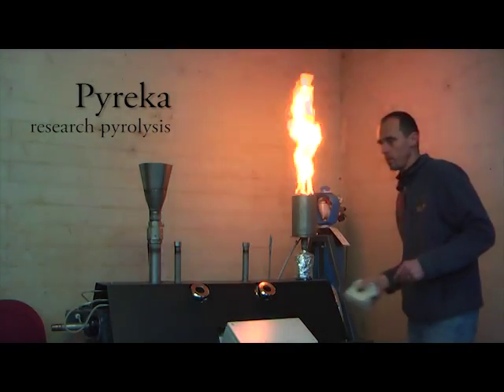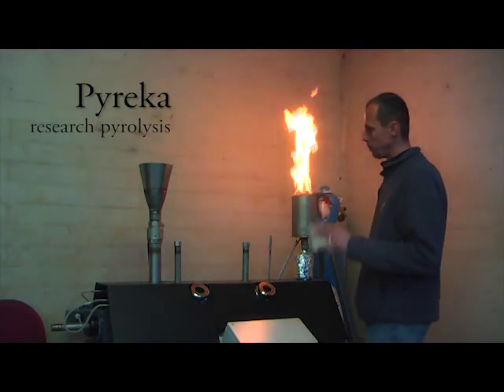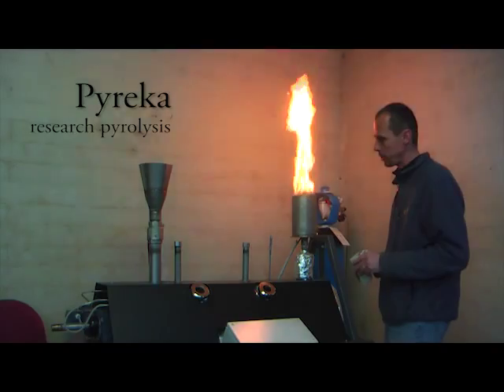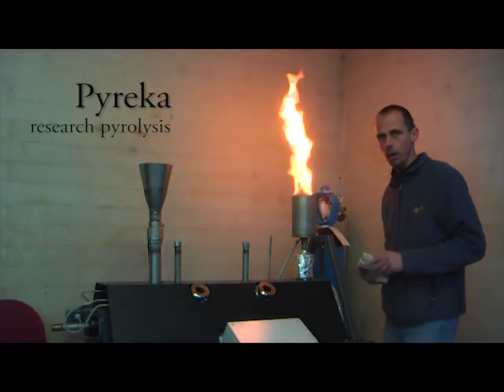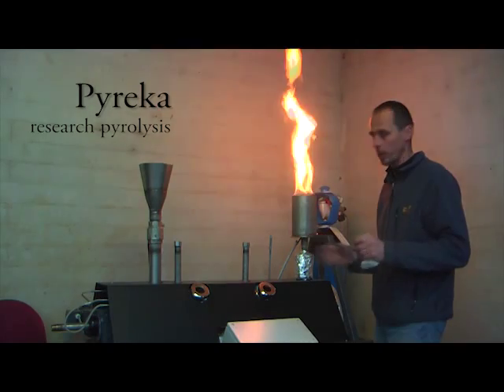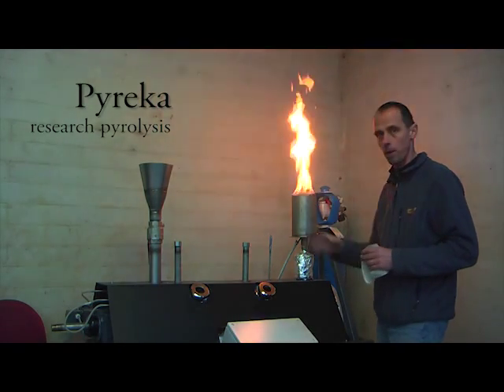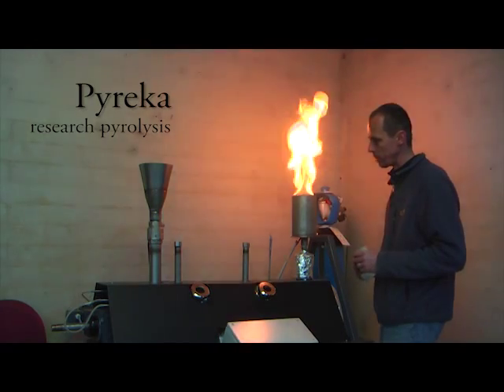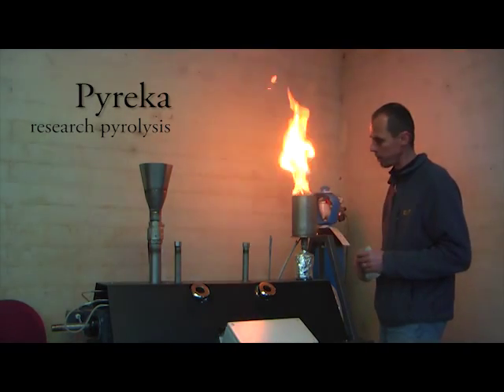This is the new Pyreka pyrolysis system to test different biomasses, different temperatures, gas flow and residence time. We can check all kinds of parameters — pyrolysis from 350 to 800 degrees at one degree steps.